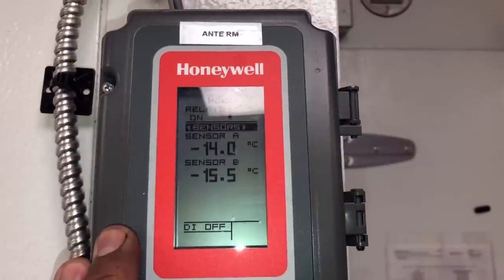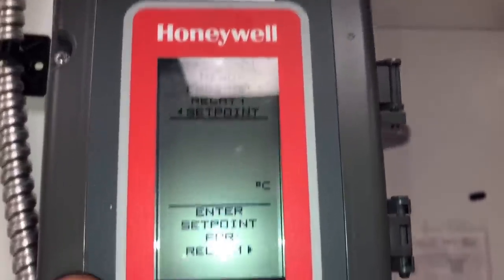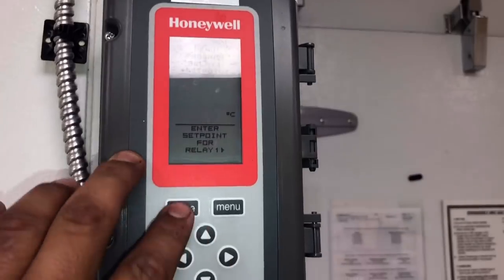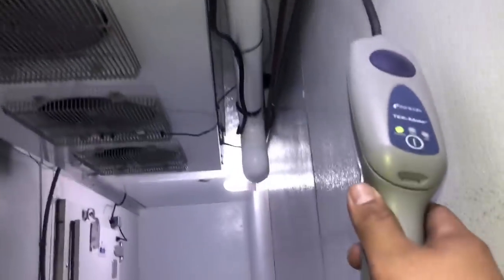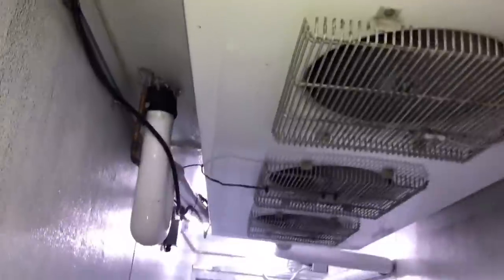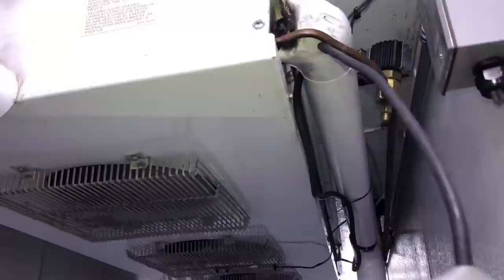We're at negative 14 and our set point is negative 20, so we're dropping pretty good — we're good to go. We didn't get any hits on the way in. This is not the best way to do a leak search — you'd want to shut the fans off and all that — but I already found the primary leak. I'm just bringing this in here to see if there's a leak inside the evaporator, and I don't get a hit. So this evaporator is leak free for the most part.